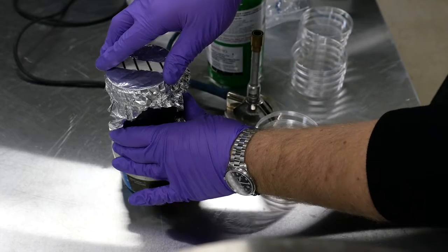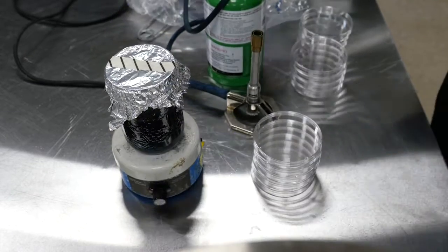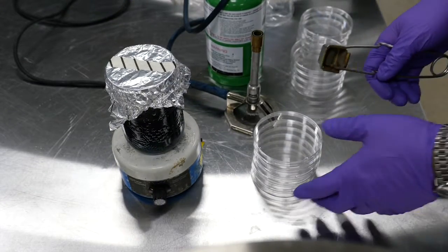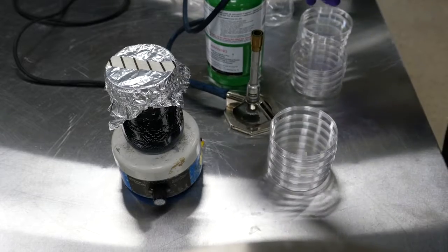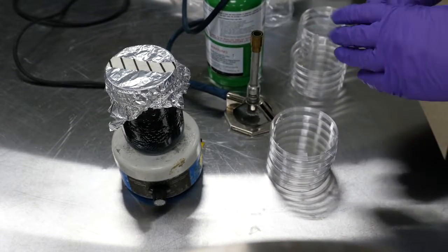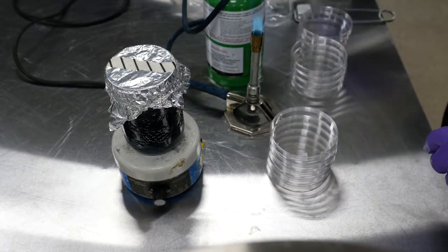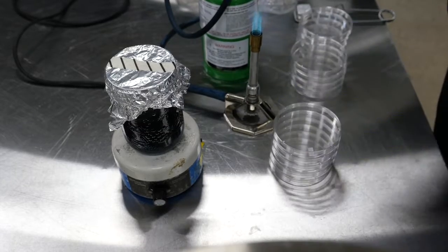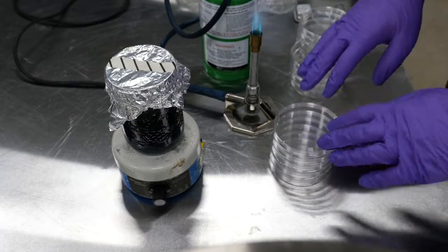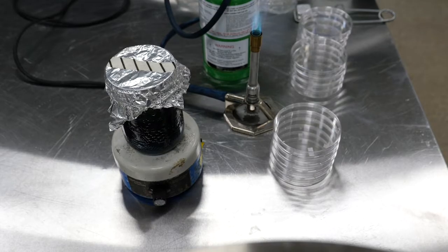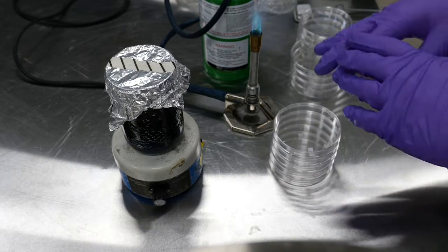And our agar is still nice and hot. We don't want it to get too cool because if it gets too cool, it will start to solidify. So next step is light up our Bunsen burner. That's going to help us to get a sanitary work area. You also need to make sure that your work area is draft free.